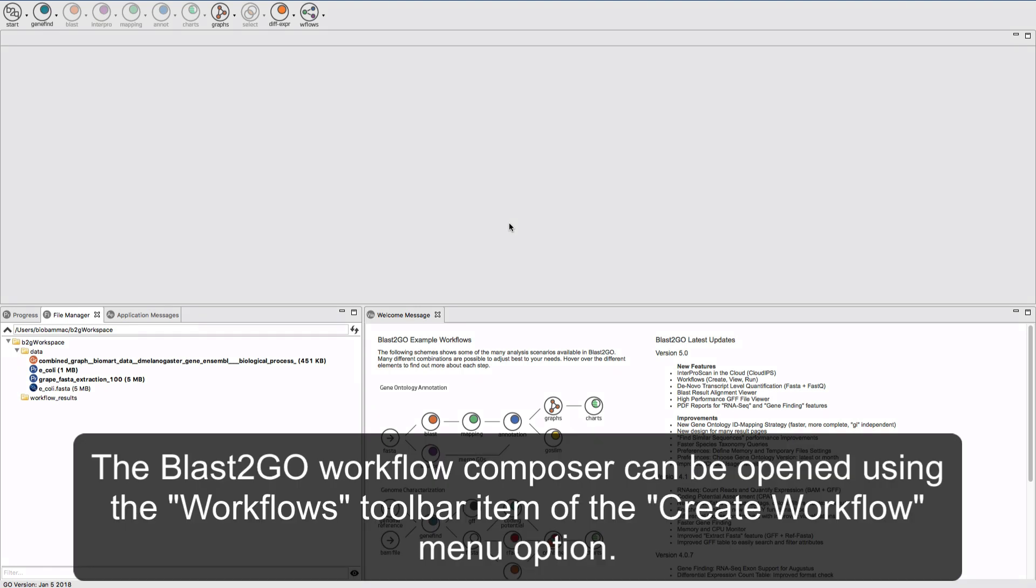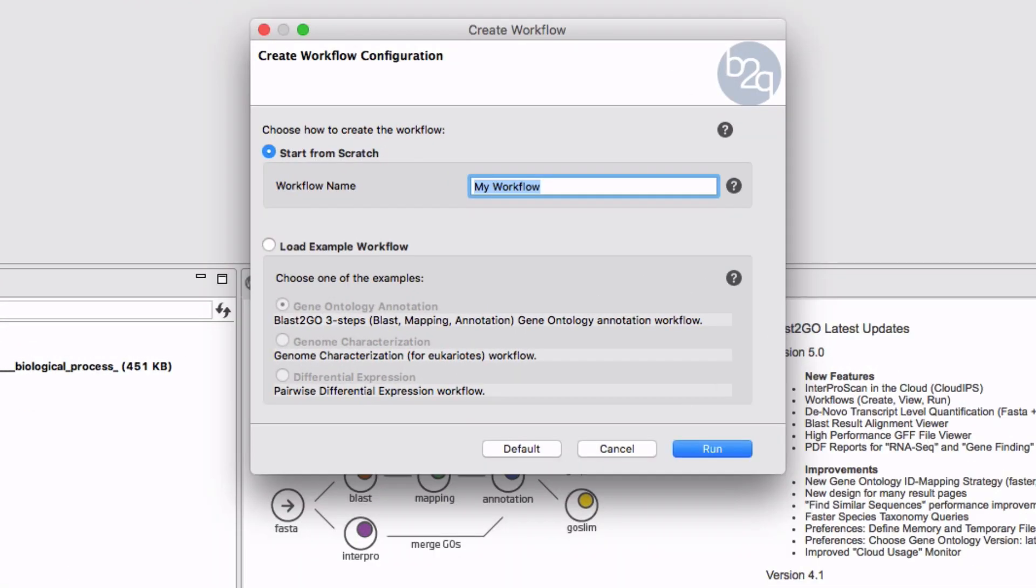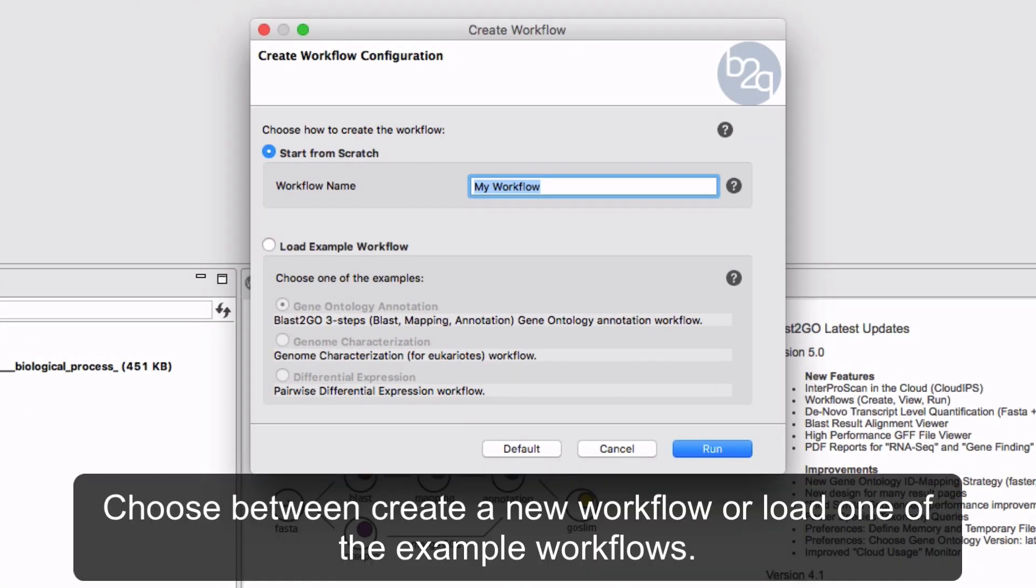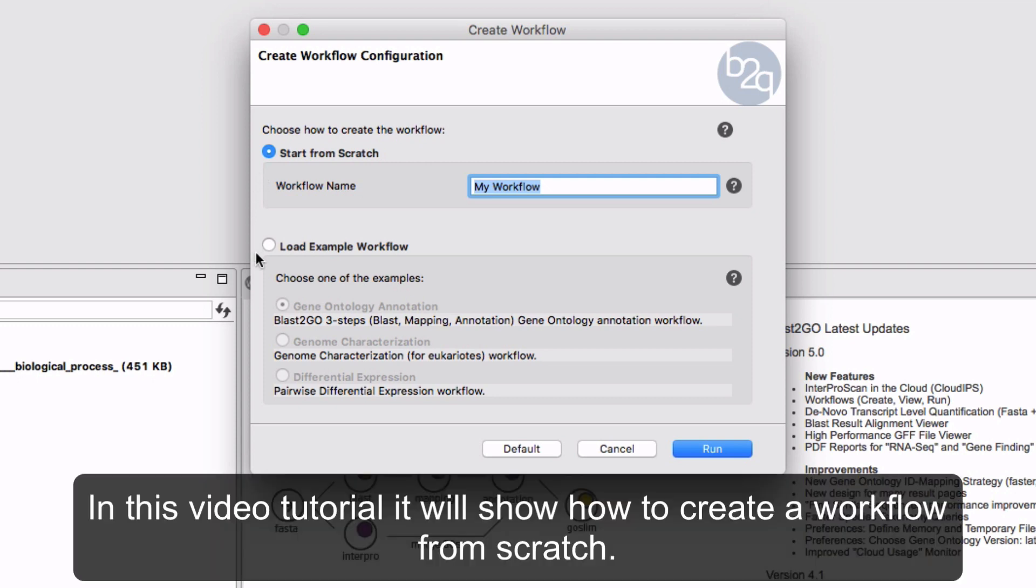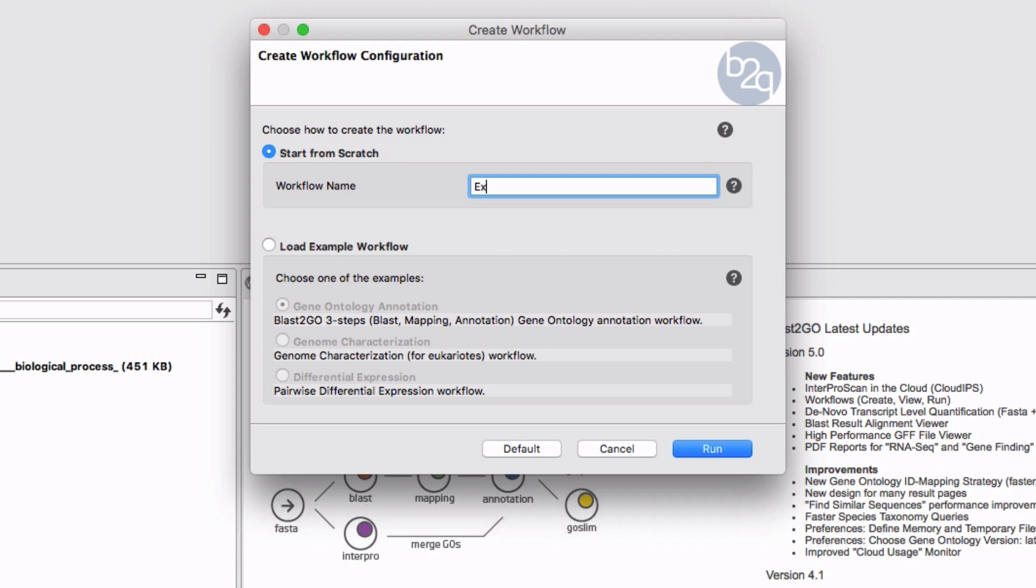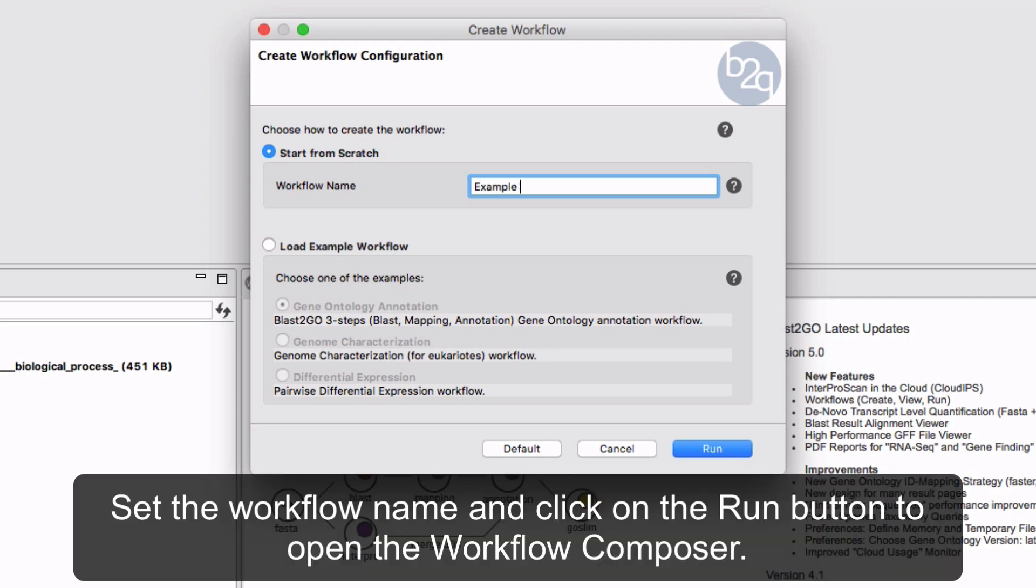The Blast2Go Workflow Composer can be opened using the Workflows toolbar in the Create Workflow menu option. Choose between Create a New Workflow or load one of the example workflows. In this video tutorial it will show how to create a workflow from scratch. Set the new workflow name and click on the Run button to open the Workflow Composer.